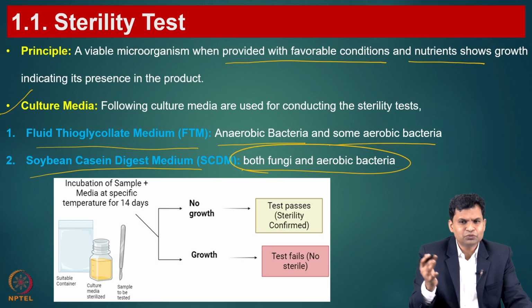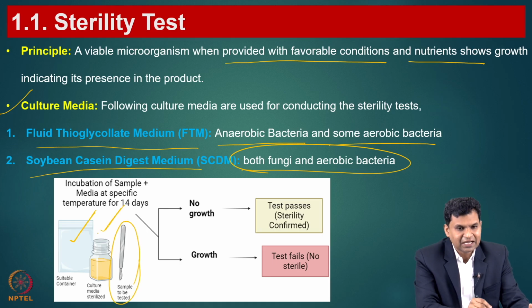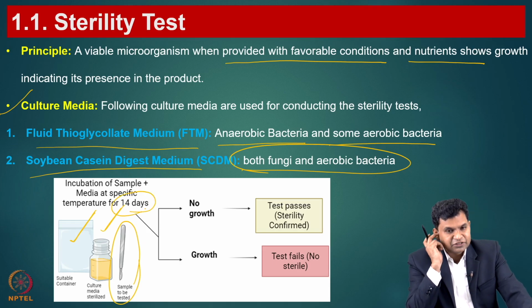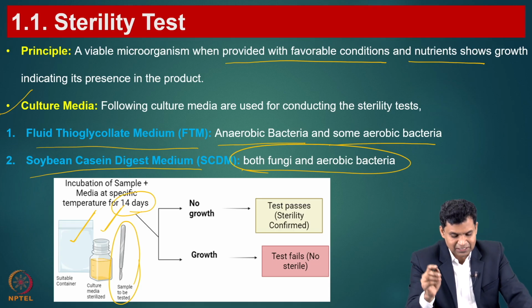In the general principle, we take our formulation, and here is the culture media in a container, and this is the sample. You need to take it and mix it in the container, and keep it at different conditions, where we provide the temperature and incubate for 14 days.